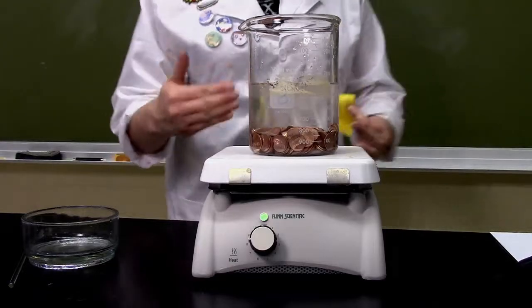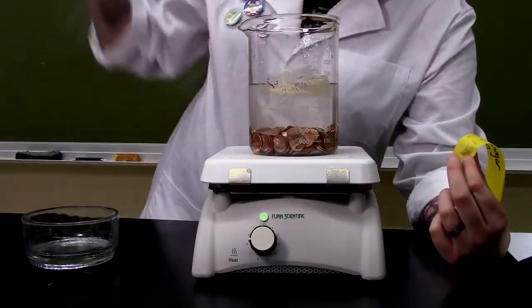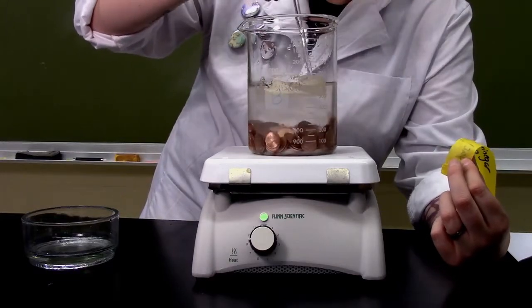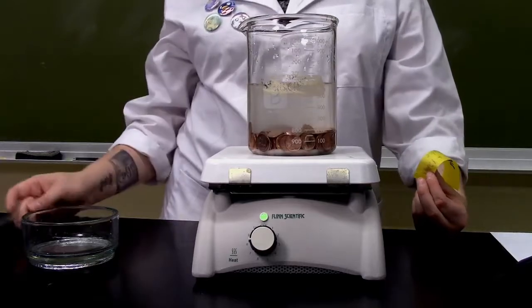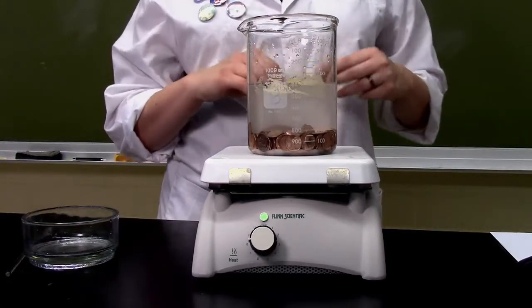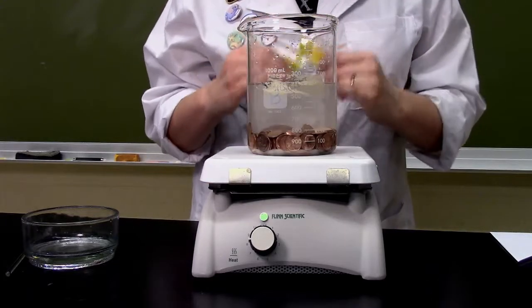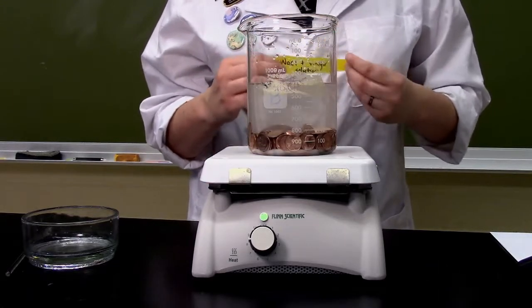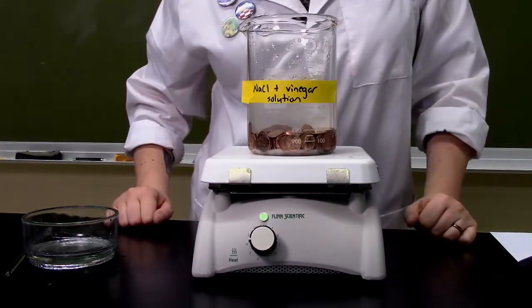Before I step away from this solution, and oh, y'all, look, you can already see the table salt dissolving, right? It turned a lot clearer. Oh, so cool. Before I step away from this solution, I want to label it. Y'all, a lot of chemistry stuff looks like clear water or somewhat clear water, so you always want to make sure that you label your stuff.